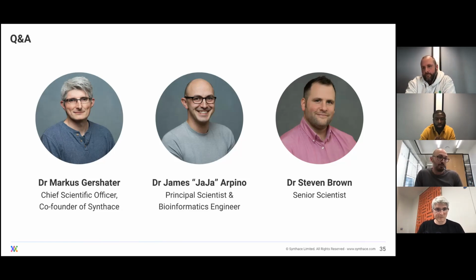We have lots of people who are using Synthace to do assay development DOEs, and we know lots of people outside of Synthace users who are applying DOE to assay development. So it's 100% applicable to that assay space. In terms of simulators, there's nothing that I'm particularly aware of off the top of my head.